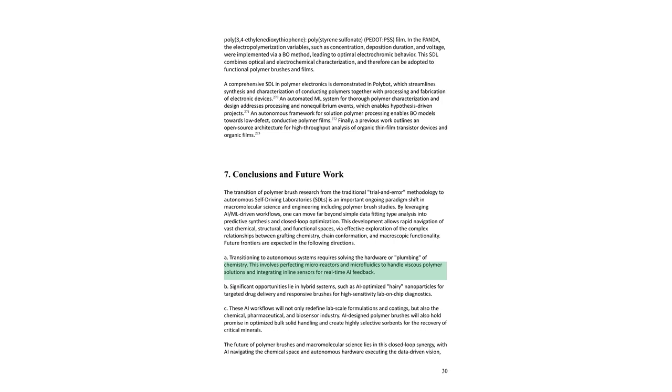The authors outline several key frontiers. First is the hardware or plumbing challenge, perfecting the microreactors and microfluidics needed to handle the often viscous and complex chemistries involved in polymer synthesis autonomously. Second is the exploration of advanced hybrid systems, such as AI-optimized hairy nanoparticles for targeted drug delivery, or highly sensitive lab-on-a-chip diagnostic devices based on responsive polymer brushes.